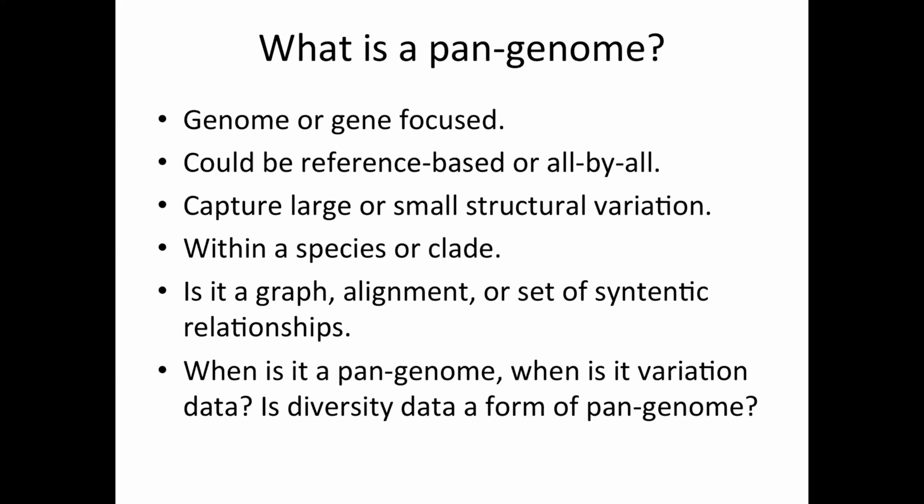focusing on a pangenome perhaps for a species or closely related species, but there's also the context when you think about pangenomes, which is a little out of this, of a plant microbe interaction. When you think about a biological system, and this is closer to some of the microbiome context, you're looking at the gene space that's required for the mechanistic model that you're looking at.